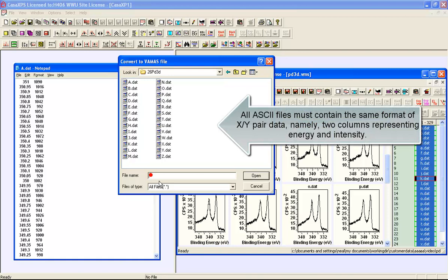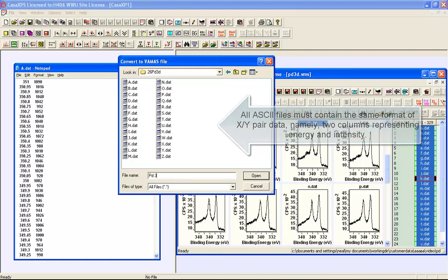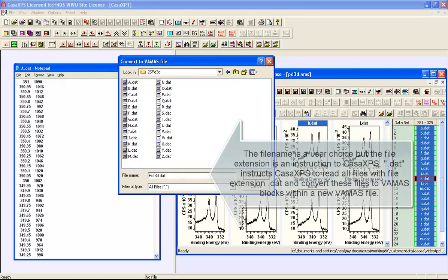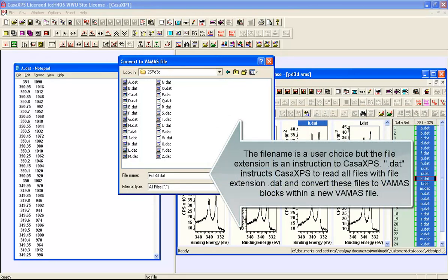So to make a conversion we can say this is palladium3d.dat and then we can add minus anode and MG.